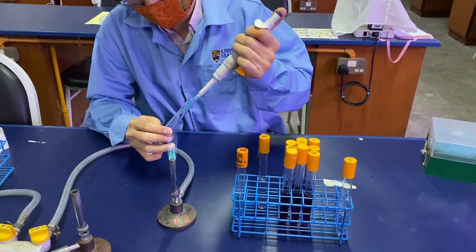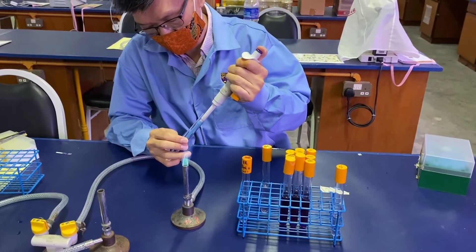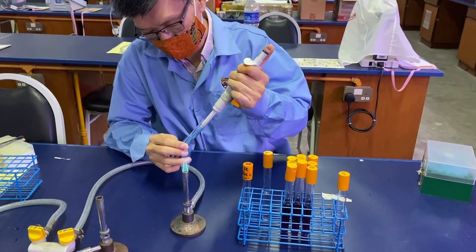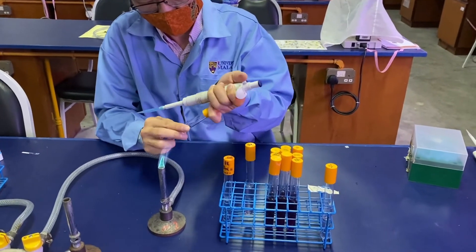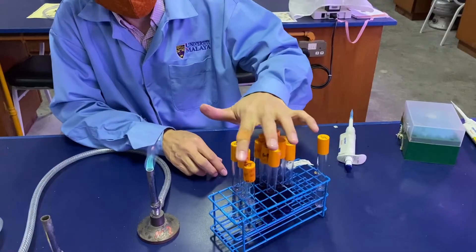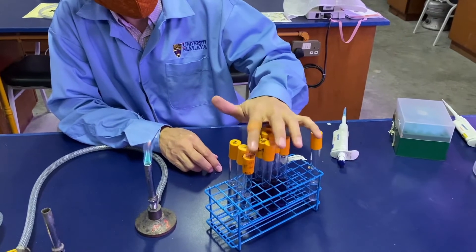Once you've carried out the serial dilution, you'll have your minus one, minus two, and minus three samples ready. Then you can proceed to dispense the sample.